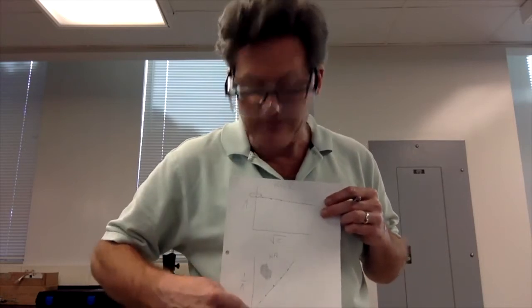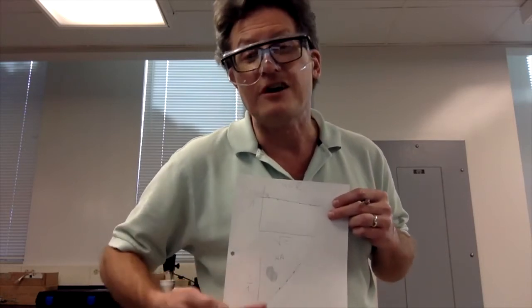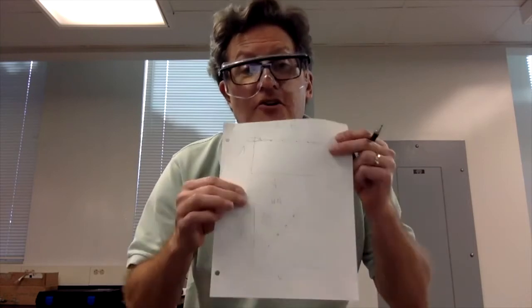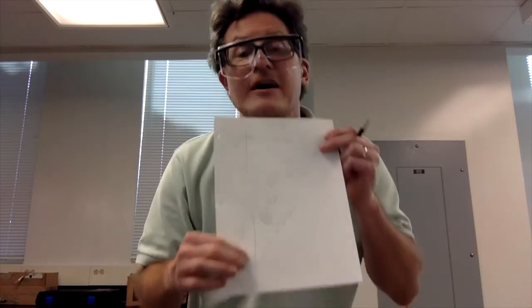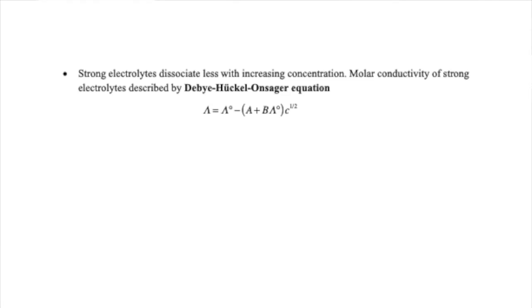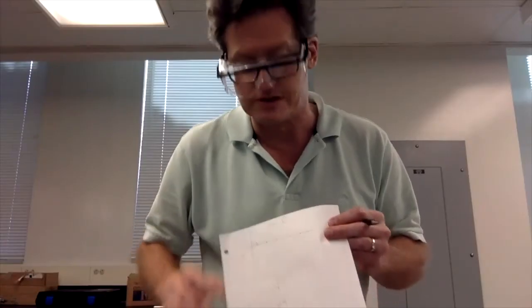Particularly because if we have an intercept near 0 and you have an offset error, the offset is comparable to the intercept you're getting. You might get the wrong sign. And it is unphysical to get a negative limiting molar conductivity. So we don't want to do that. We're going to use the slope in our analysis for acetic acid. For KCl, we're going to use the intercept because it's a big intercept on a flat line, right? Not an intercept going towards 0. So we can use that for KCl.